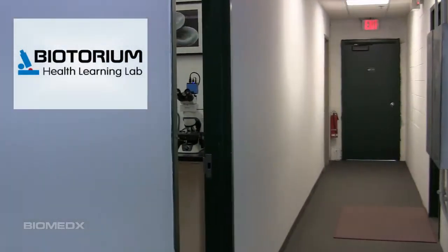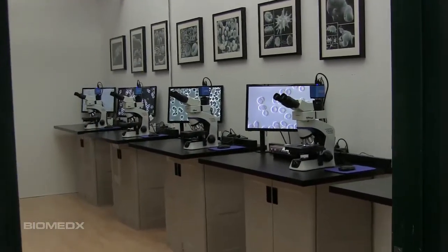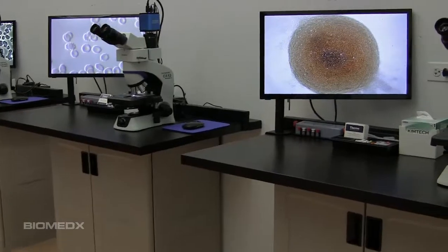Here we are just outside the Biomedx Biotorium. We're going to step inside. We're going to see a wall of microscopes. We have 5 workstations here. We have 3 more on another wall with larger screens, but these 5 are set up with 5 different lighting configurations that I wanted to quickly show you.